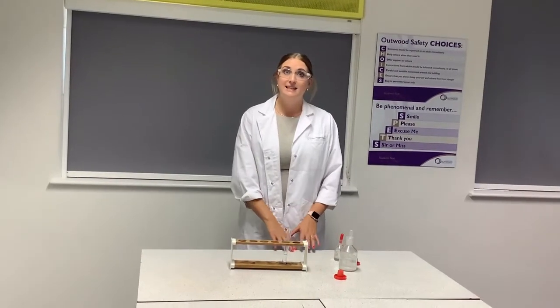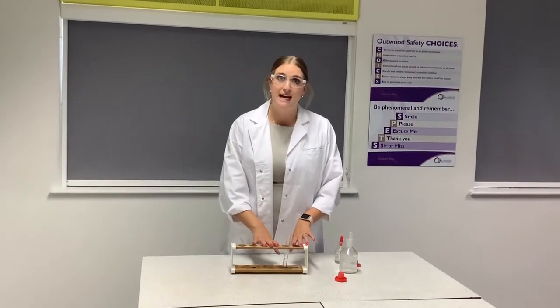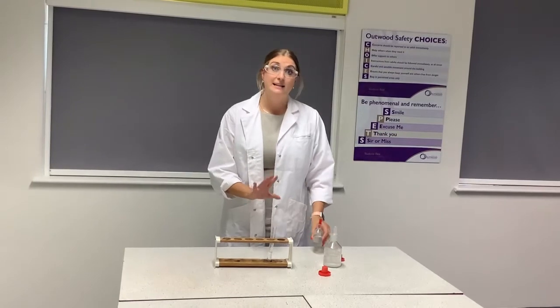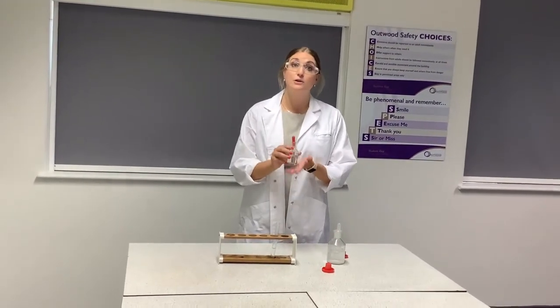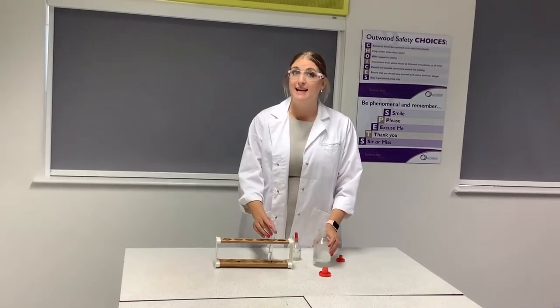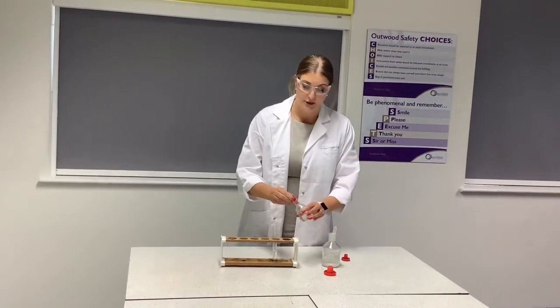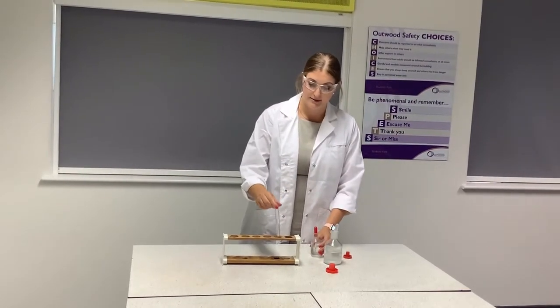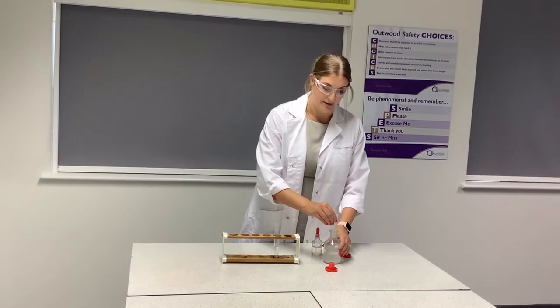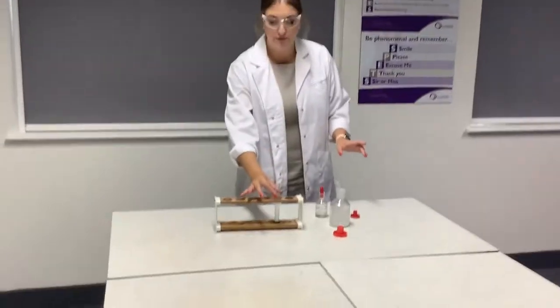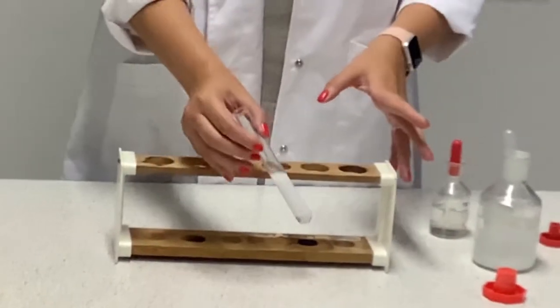Now that we've seen the test for halide ions, there is a different test for sulfate ions, so we're going to need different reactants. Instead of the previous reactions, I'm going to use hydrochloric acid and then add barium chloride. I'll add the hydrochloric acid first to my sulfate ions, give it a small mix, and then when I add my barium chloride solution we should see a precipitate form. It is quite clearly white — so that is the test for sulfate ions.